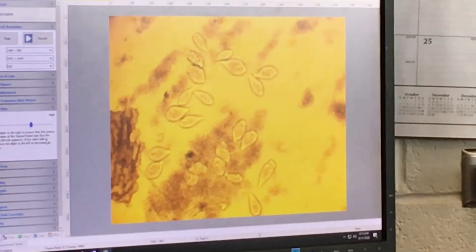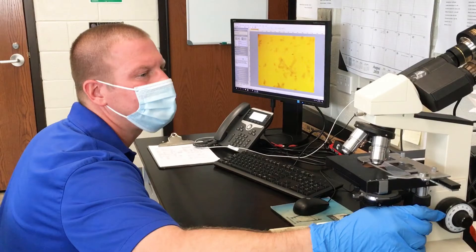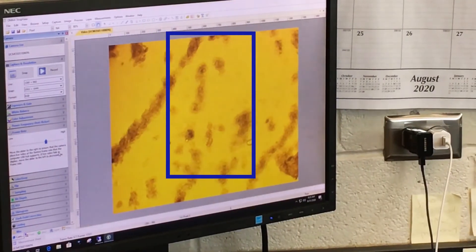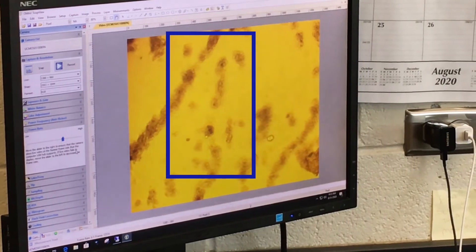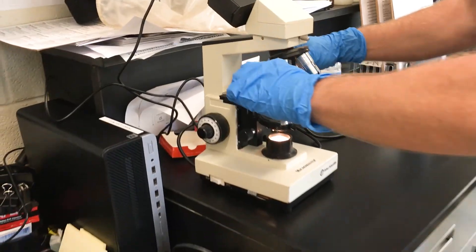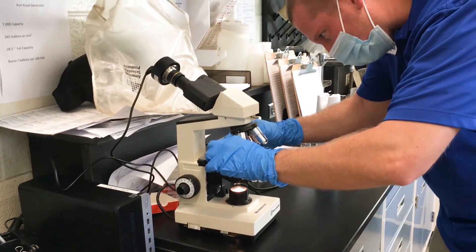What we're doing today is we're looking at the bacteria in the wastewater that actually eat the waste that comes into the treatment plant. What you see here is a stalk ciliate forming and you can actually see a free swimmer cell moving around right there — it's coming down and it just actually grabbed on to this stalk. It's really important to check for these in your wastewater treatment plant so that you know you have healthy bacteria and a healthy floc.